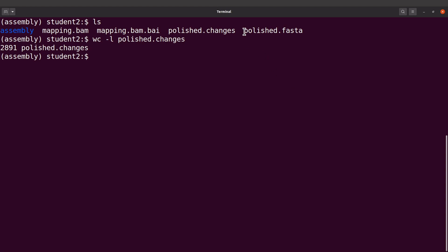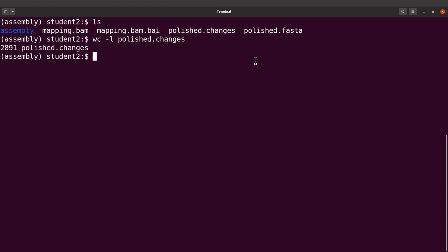And the polished assembly is the polished.fasta file. What we should know is that Nanopore can have homopolymer deletions, and this can be corrected by polishing with Illumina reads, and that is what we have done. So in other words, polishing can improve the assembly by correcting errors that will improve the sequence data. So now we have our polished assembly.